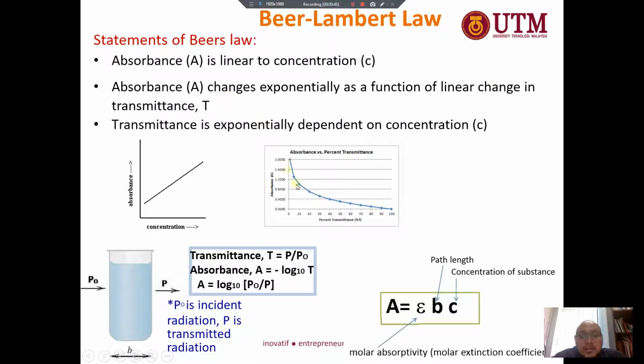What I mean by that is this. Let's look here. At full absorbance, there is zero transmittance. It means that everything is absorbed by the analyte. Again, I repeat, if we look over here, at zero transmittance, it means full absorbance. Everything is absorbed by the analyte, so the analyte totally absorbed the light.